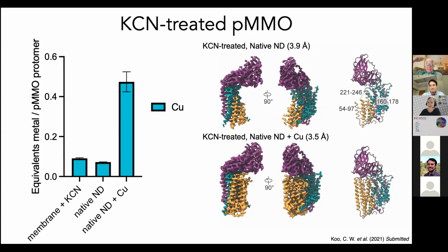All right. Well, if we have no more questions, Christopher, thank you so much for that fantastic talk. We will certainly be keeping our ears peeled for any way people might come up with to identify metals using cryo-EM data. The difference in the way that electrons interact with proteins compared to X-rays is a bit of a challenge in that respect. And someone just posted one suggestion in the chat that we can look at.